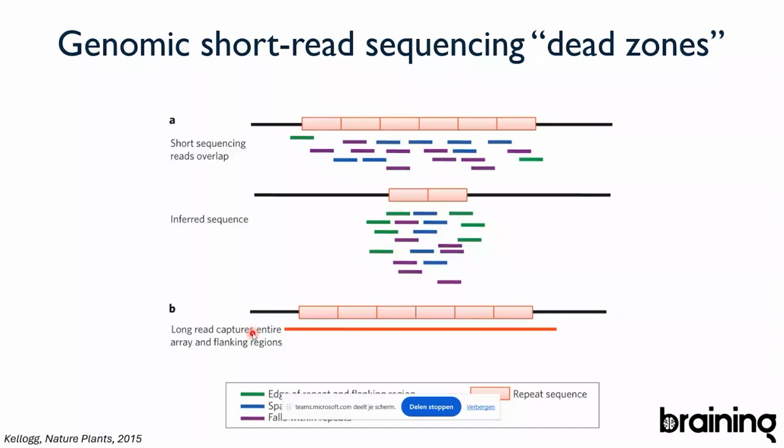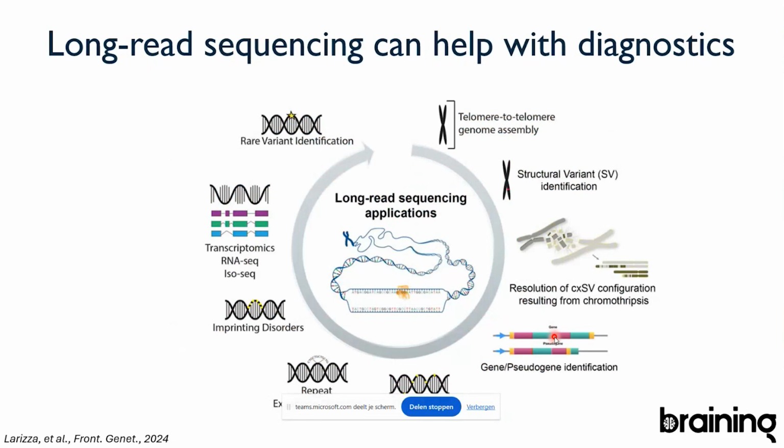Because we start here and we will read the molecule from beginning to end. And in that way, we know there are 6 repeat regions. So there are some disorders that are related to genomic repeats. Now there are relatively labor-intensive and cumbersome methods to know how many repeats a patient has, but with long-read sequencing, this would be much easier.